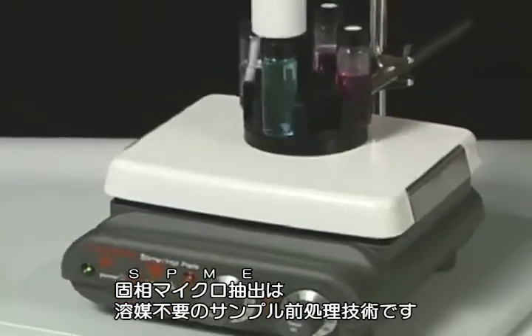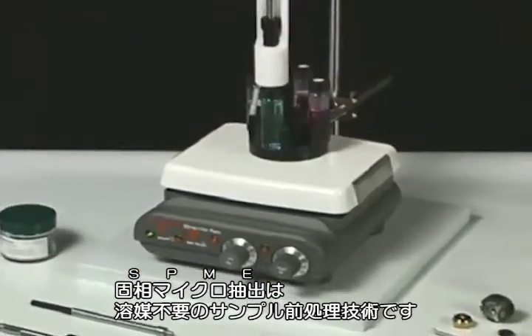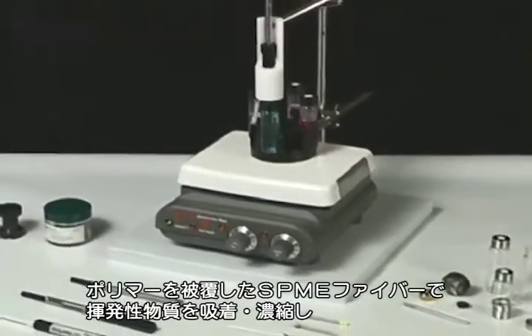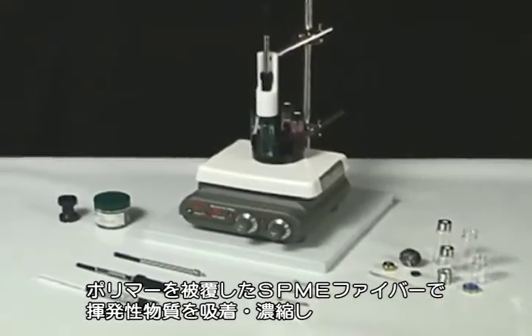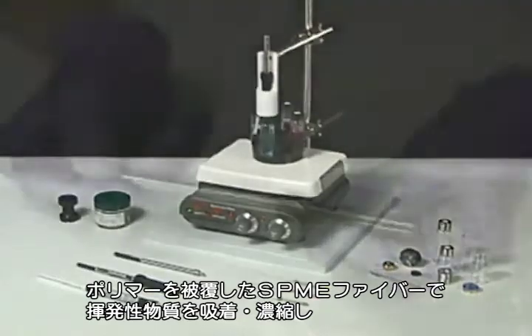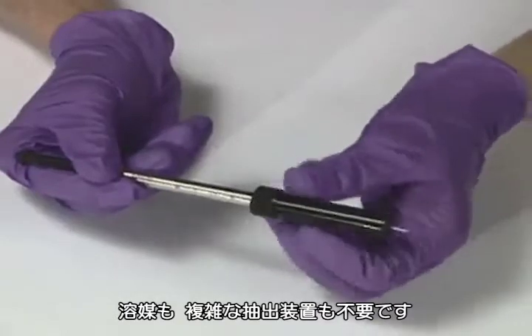Supelco Solid Phase Micro Extraction, or SPME, is a unique solventless sample prep technique. SPME uses a polymer-coated fiber to concentrate volatile and semi-volatile organics in one extraction step. SPME requires no solvents or complicated extraction apparatus.